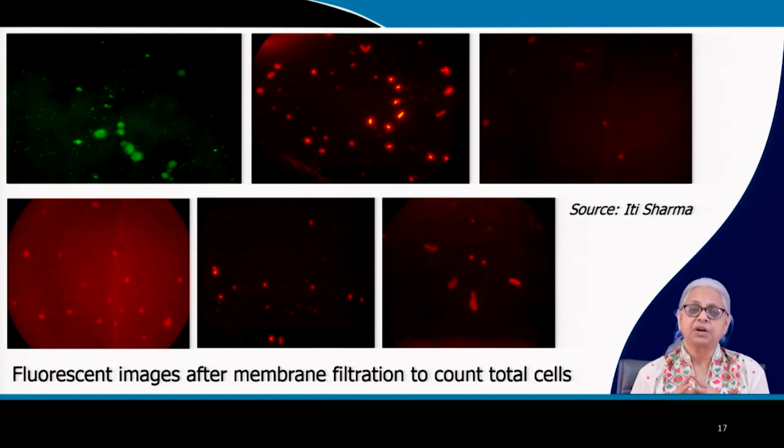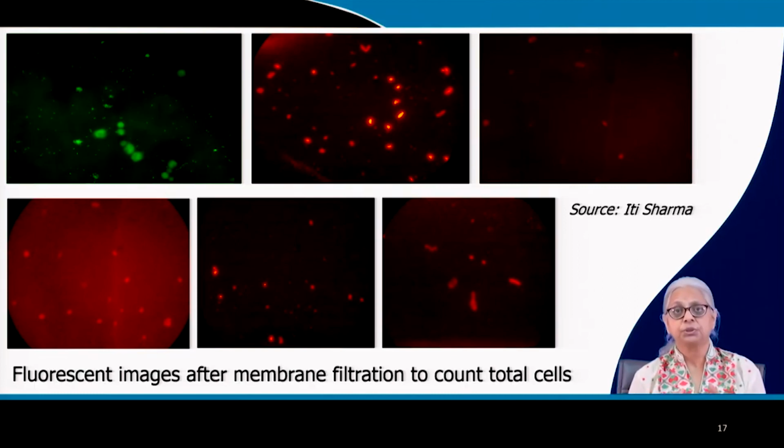So the very first 5 minutes is when you can do some useful work with this dye, and that's why having a camera and a PC is very important, because then you can capture the images in the very first 5 minutes and then count the number of bacteria when you get time. So this is useful for enumerating bacteria and for storing images on either a PC or any other device. This has taken a lot of the tedium out of enumeration of bacteria.